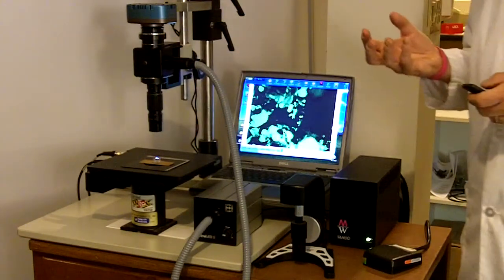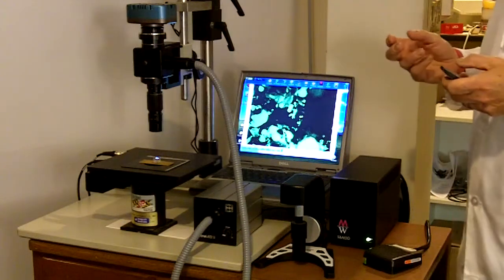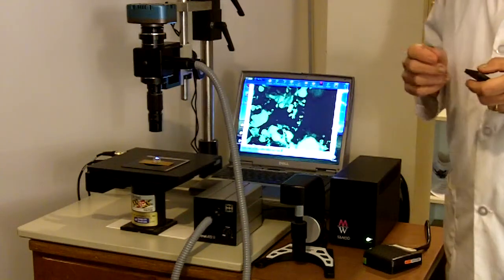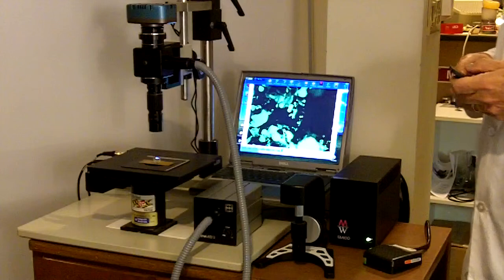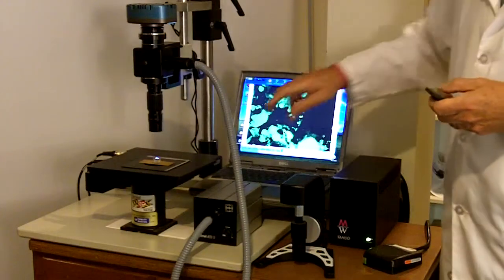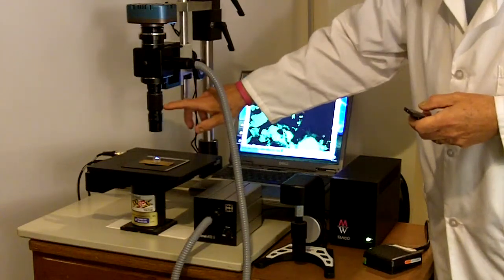You can get magnification ranges at the low end and at the high end that would be unheard of with even the best stereo microscope. So here we have the microscope with internal focusing.